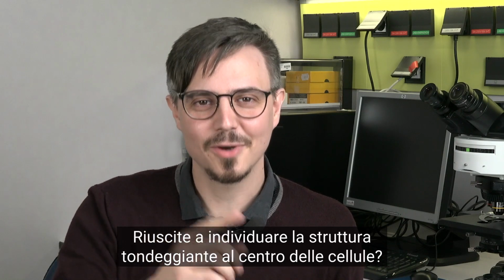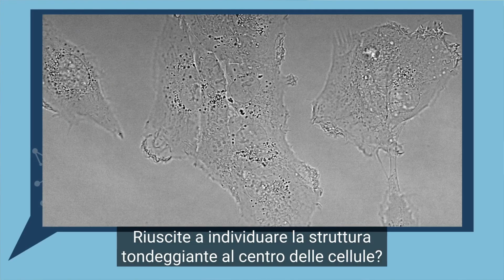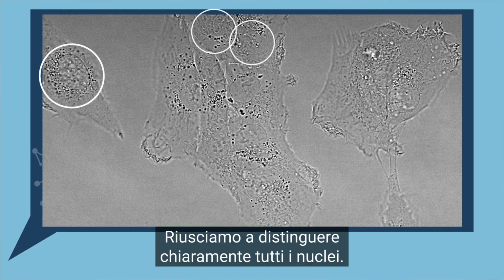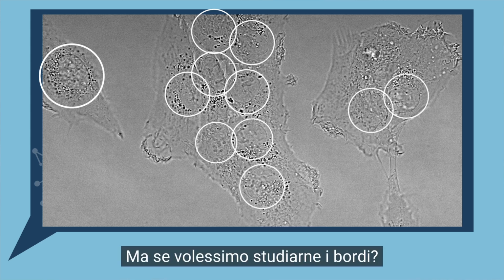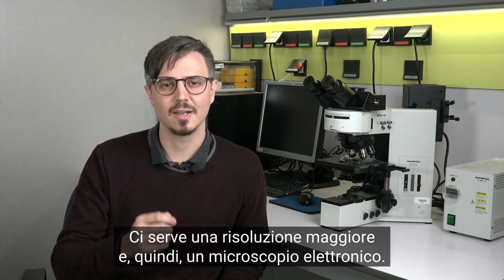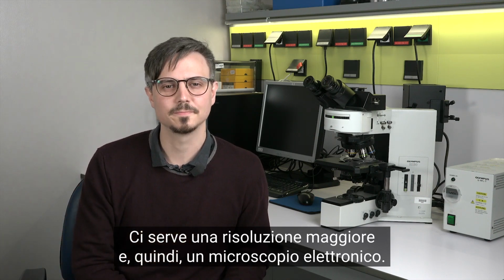Can you spot the rounded structure that is in the middle of the cells? That's the nucleus, where the DNA is stored. We can clearly distinguish each one of the nuclei, but what if we want to study the nuclear edges? Then we need more resolution and an electron microscope is required.